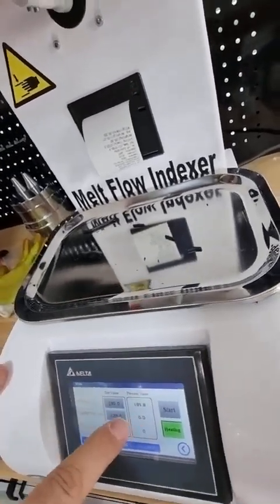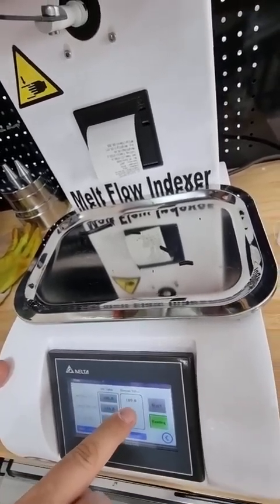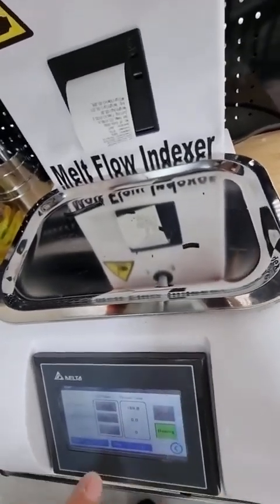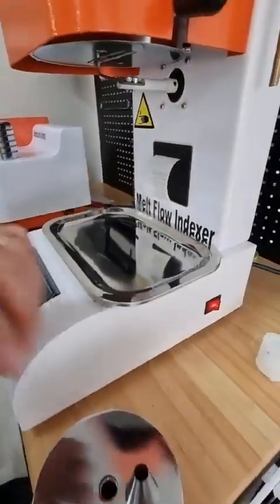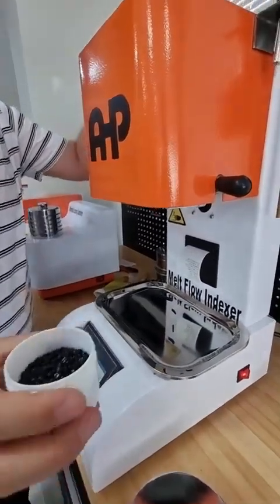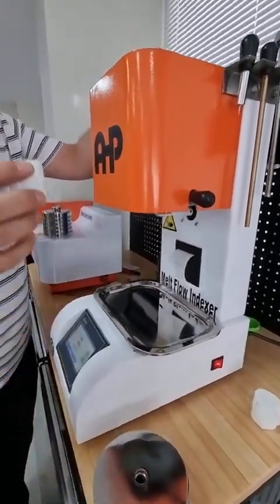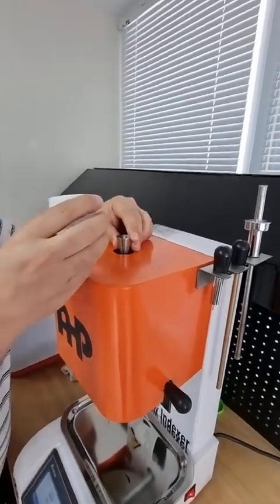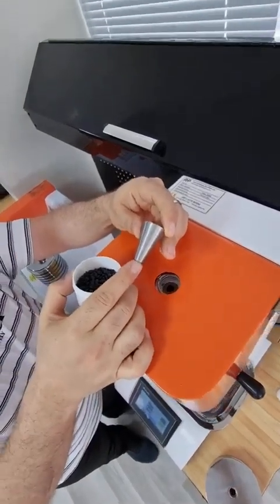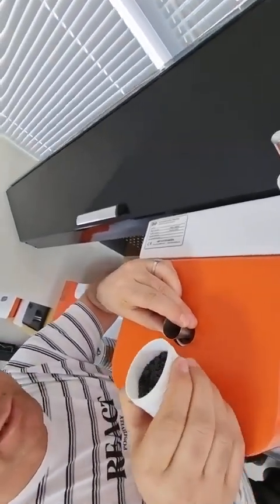After setting the temperature, wait at least 20 minutes for the whole cylinder to stabilize at the set temperature. The set temperature is 190°C and the present value is 189.8°C. Now we've waited 20 minutes and can start the test. Fill the cylinder with the sample — granules or ground pieces from the product. Three to five grams of material is enough.